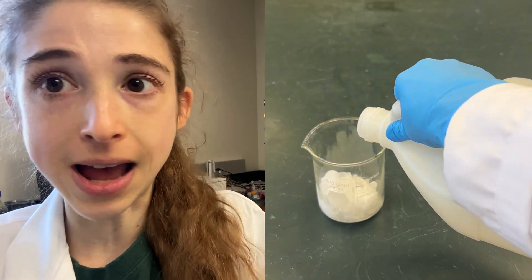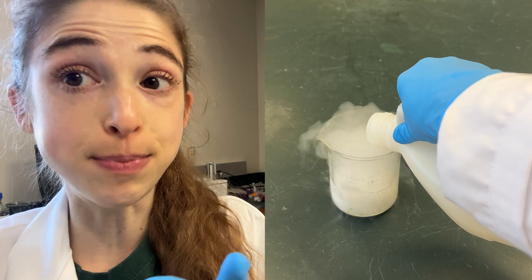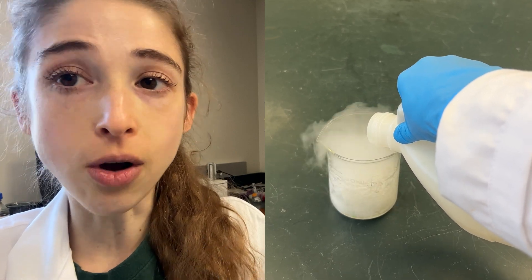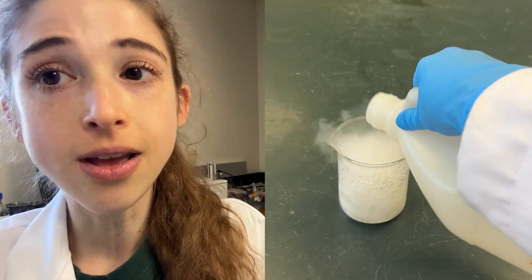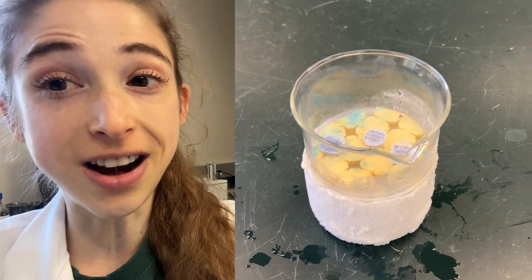If you need to flash freeze some samples but your lab's out of liquid nitrogen, don't panic. You can still make a dry ice bath using dry ice and an alcohol like ethanol or isopropanol. That will still do the trick, though it won't freeze your samples quite as quickly as liquid nitrogen.